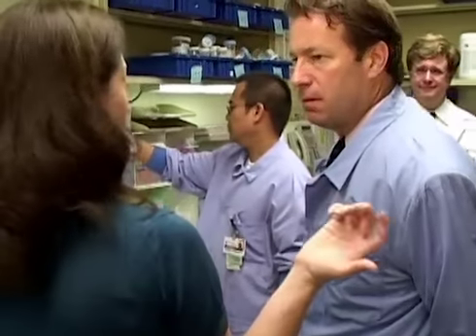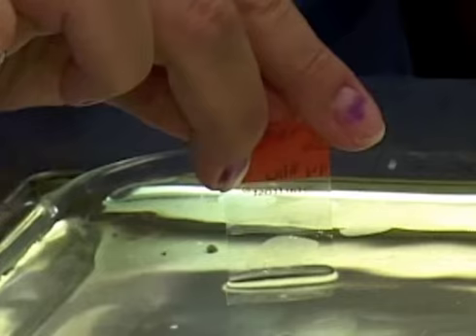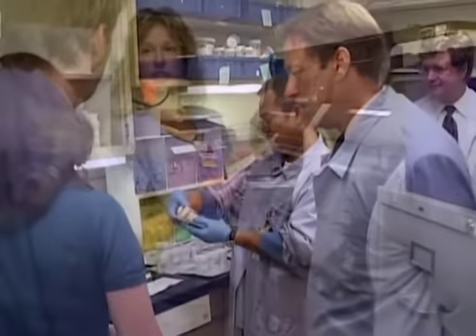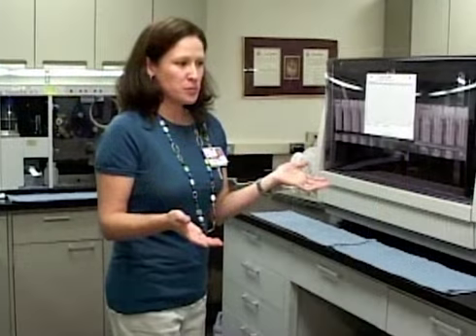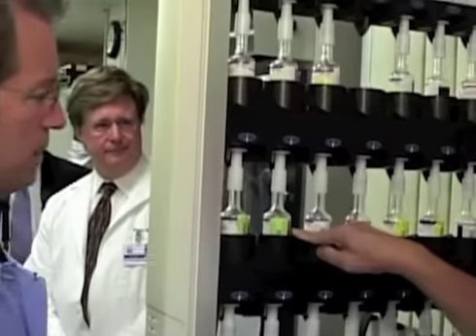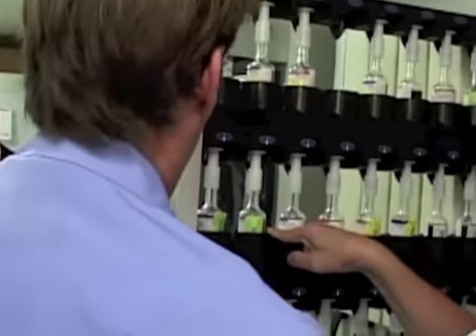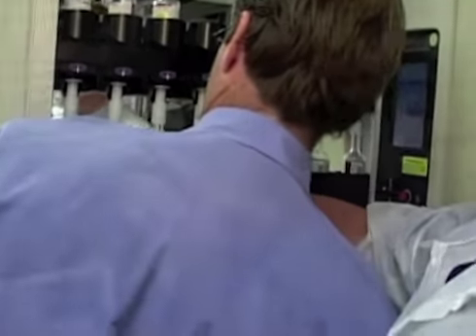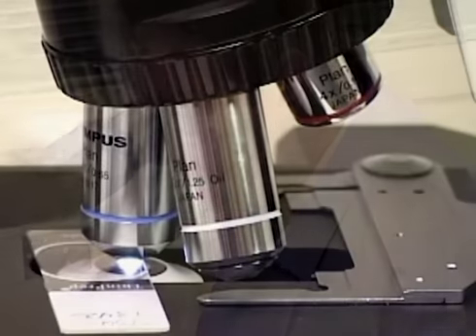Also, it is important to encourage the member to talk with laboratory staff to get a feel for what happens with a specimen when it is examined. Members of Congress should also be given a hands-on demonstration of the equipment used to aid pathologists in giving an accurate diagnosis. This includes a close-up view through a microscope to see what a pathologist sees when determining a diagnosis.